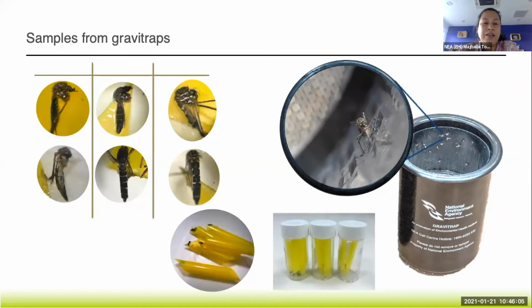The last one is Aedes malayensis. What made you say that this is malayensis? You can see the 2 parallel white lines on the thorax, and you can see incomplete bands. Yes, those parallel lines on the thorax tell us that this is malayensis, and you have the subbasal, incomplete bands on the dorsal side of the abdomen. But the middle one, yes, thank you.